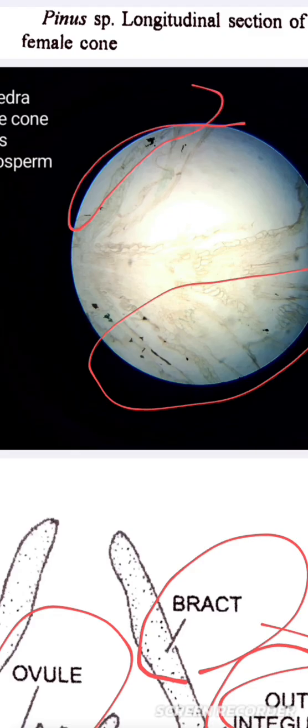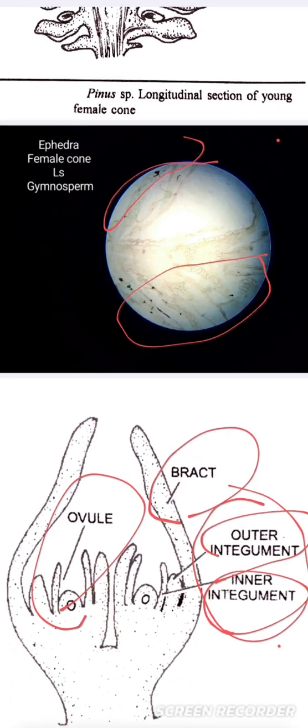So this is the complete video lecture on the longitudinal sections and transverse section of Pinus and Ephedra.